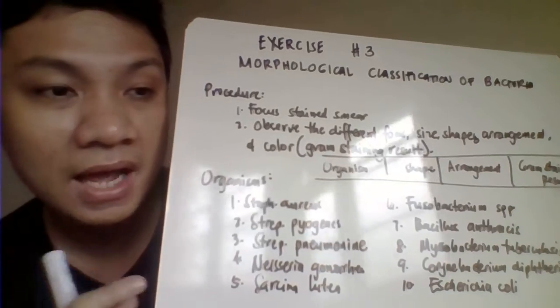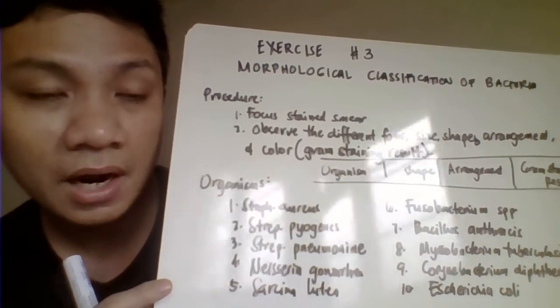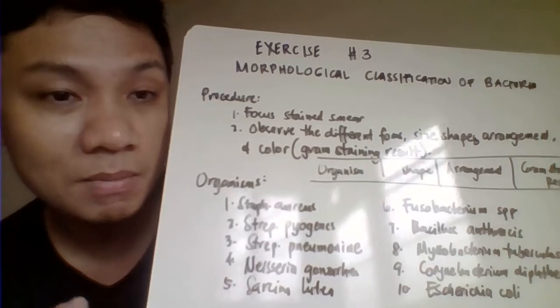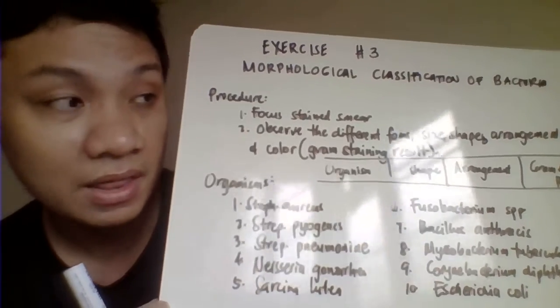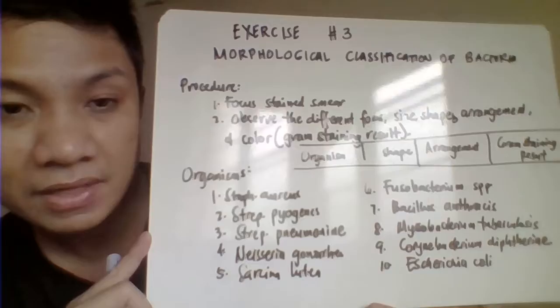So make sure that each of the bacterial morphologies is clearly drawn. You need to draw it such that it appears round, so cocci, bacilli, something like that, or you could have other structures present. Okay, so that's all for this activity. Okay, thank you.